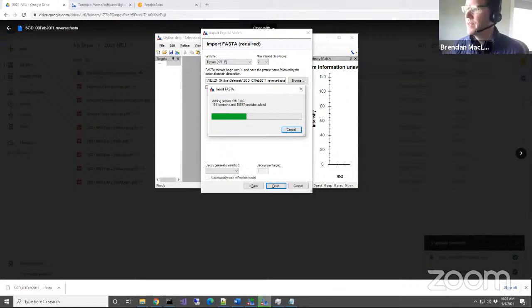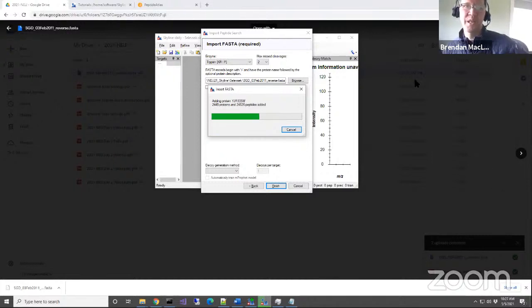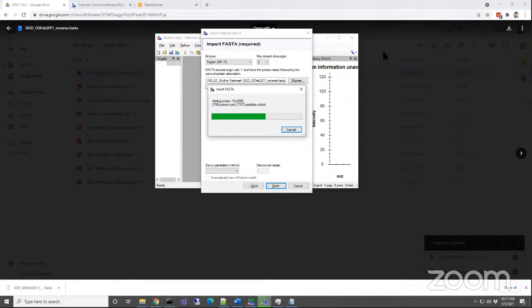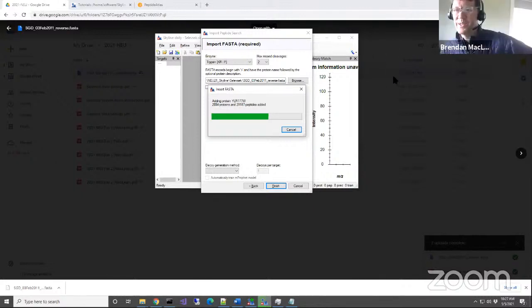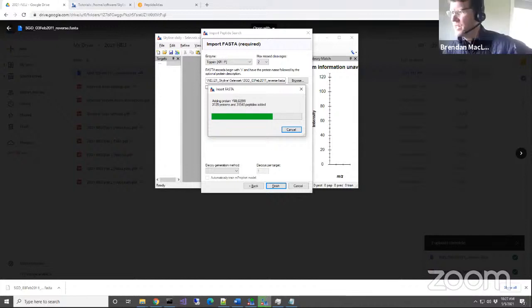Once you import data, build the mProphet model and choose that window. Is there a way to look at the values of the model again, the window that pops up at the end? Yes, we did that earlier with Bruder. You go Edit, Reintegrate, or Refine, Reintegrate, and then you'll see the model and you say Edit Current, and that will pop up the window and you can explore as much as you want.